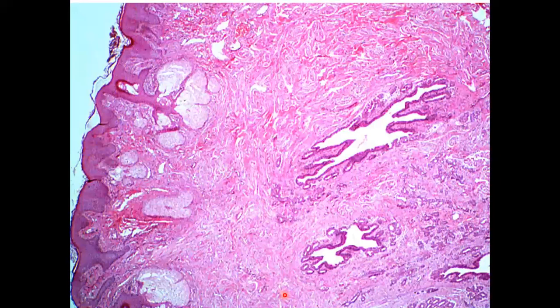This is the area of the areola and nipple. Here you will find the Montgomery glands, and the duct system of the mammary gland.